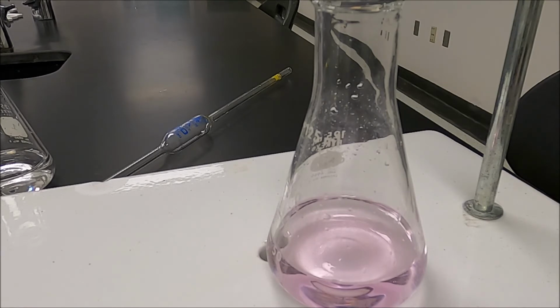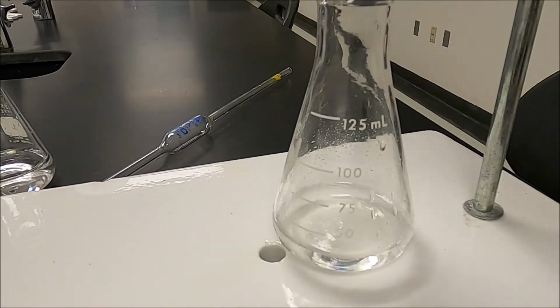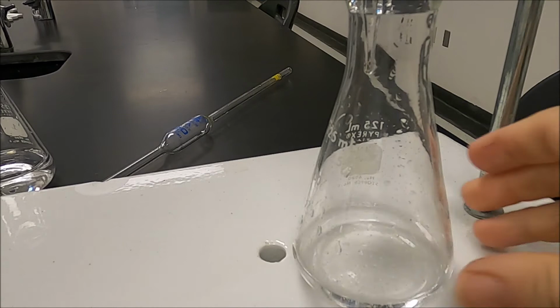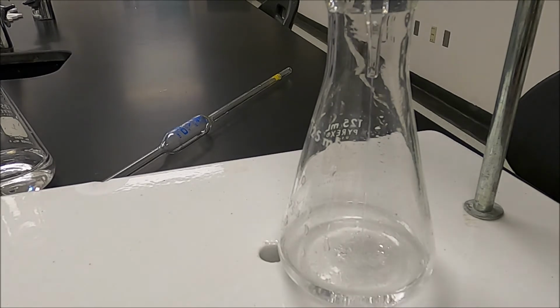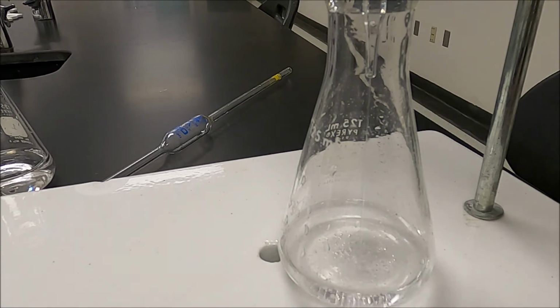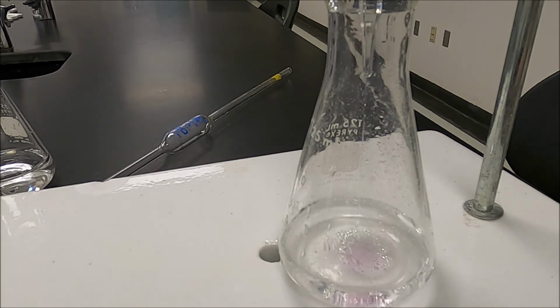So I'm going to refill the burette, get it back up to the 0 line. Okay, and we move on to our third one. Again, I want the tip of the burette in. My initial burette reading is 0.00, and I'm going to go down very rapidly to 20 milliliters. And after 20 milliliters, I'll start going slow.